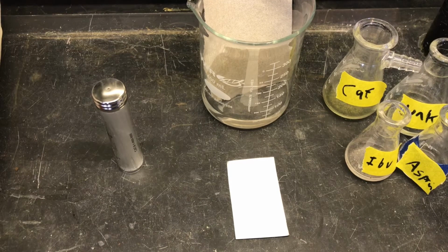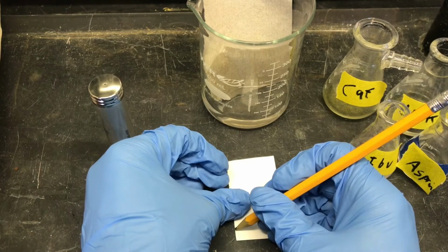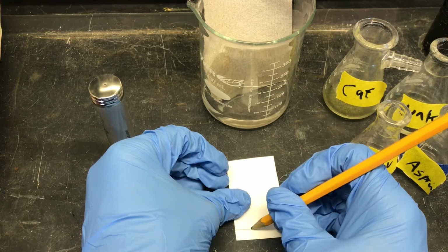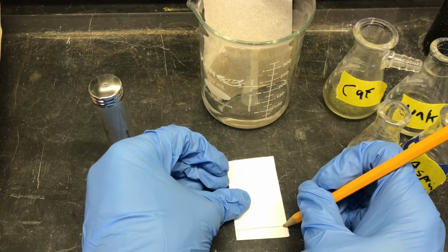You would usually try a few different eluents to make sure that you get the proper separation, but in this instance we already know ethyl acetate works well, so we're going to just assume that it's going to work well again this time. Anyway, to start off, draw a straight line near the bottom of your TLC plate. It doesn't matter exactly where, considering this is going to be the starting point for your substances. You can just pick an arbitrary point, but near the bottom, a straight line is what you want.